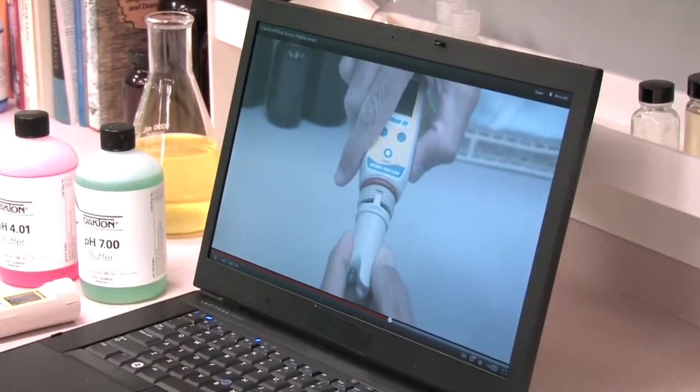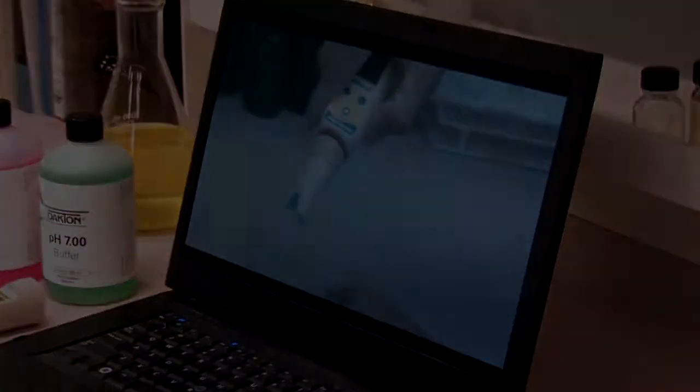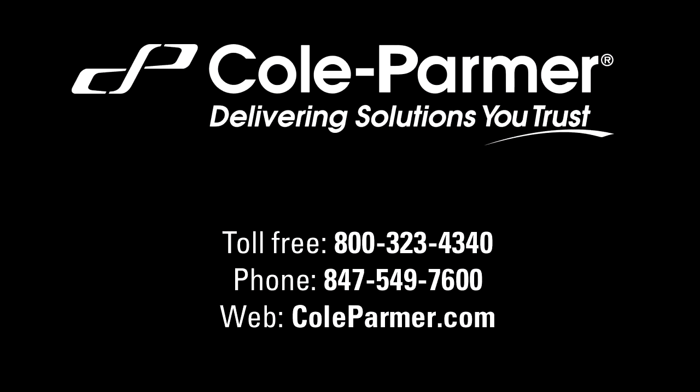View our pH sensor module replacement video for a step-by-step demonstration. Look to Oakton to meet your pH testing requirements.